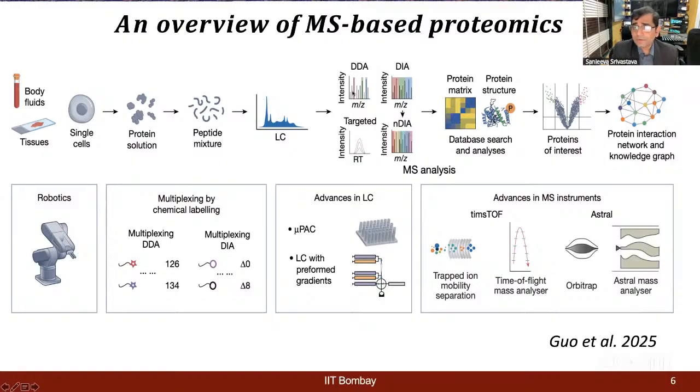Again, I don't want to make it very theoretical and detailed, but just wanted to give you the bird's eye view that to acquire your data and do quantitative proteomics, you can follow one of these two workflows. Currently, DIA is more recommended.